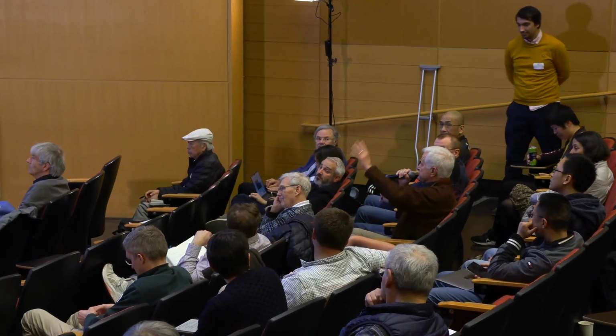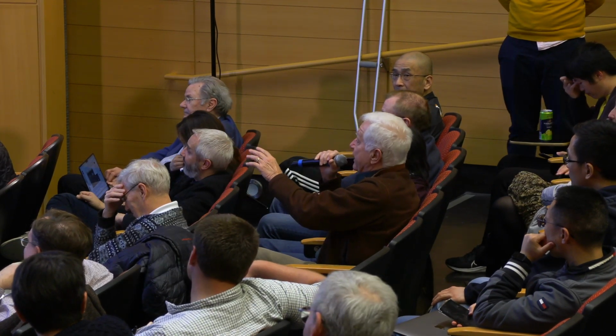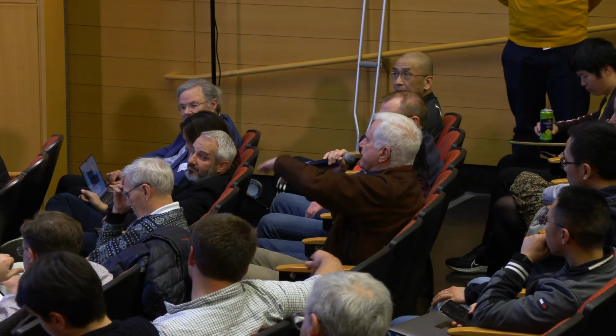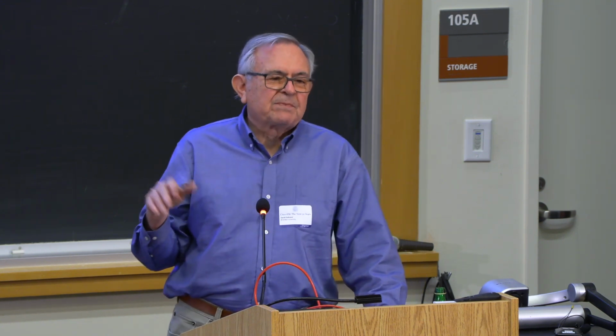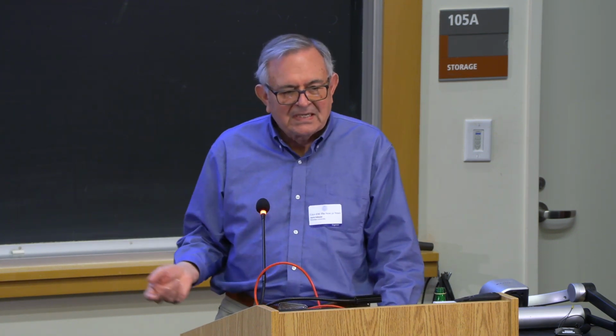Well, there's another collection of constraints in limiting the data, certainly in Fourier space, where you could apply, I think you've heard of it, the Crowther criterion, and say that since the data that we have from -60 to +60 has a limitation on its own resolution, you're not allowed to trust anything beyond that resolution, which for a tomogram is 50 or 60 angstrom given that thickness. You'd say, don't even try to fill in the missing wedge beyond that resolution, and that's another constraint. Yes, exactly. So there's only a certain resolution within reciprocal space you need to worry about. In the case of Bessel functions, it's how big are the Bessel functions you have to worry about, right?